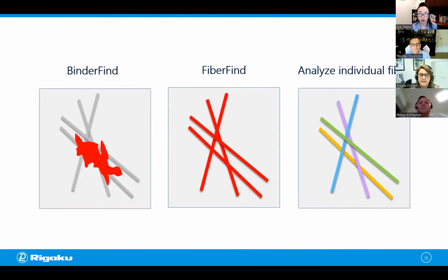The second constraint is that some networks require the fibers to be oriented mainly in the XY plane so that your filtration experiment goes through the Z plane. That's completely easy to change in GeoDict, and we're going to look at that as well. The final constraint that I'll mention is that fiber identification in GeoDict 2022 only works for circular fibers.